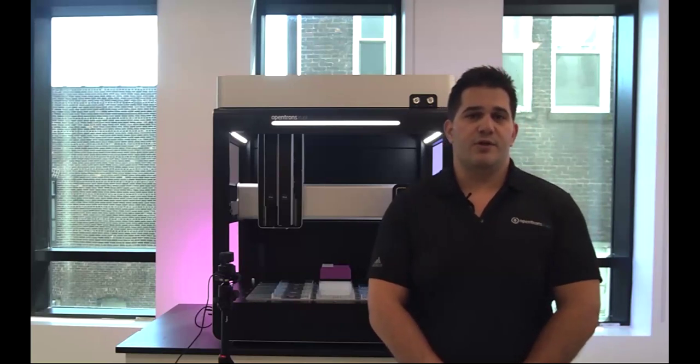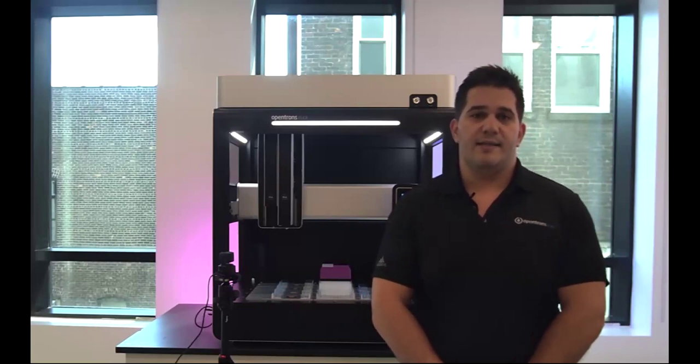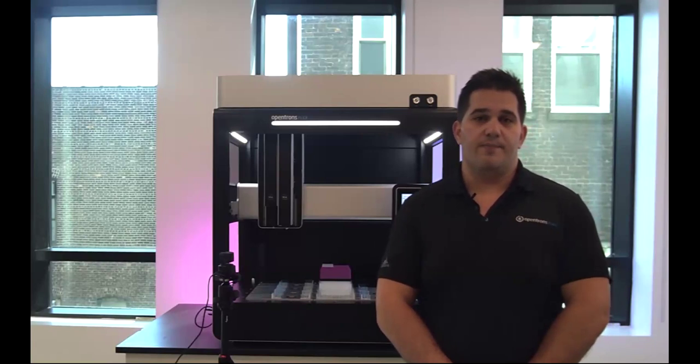First, I'm going to show you a few key features of the OpenTrons Flex Prep, and then Nick is going to demonstrate just how quick and easy it is to use the quick transfer software. We'll take questions at the end, like I mentioned, so please type them into the Q&A box whenever you want.